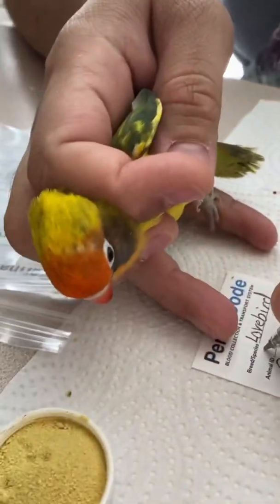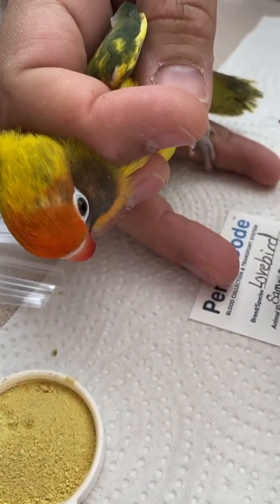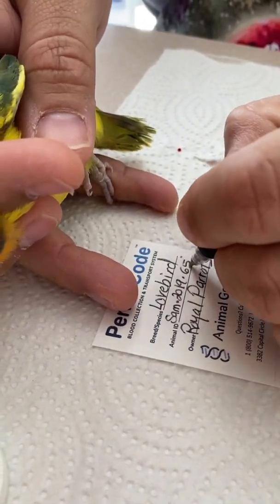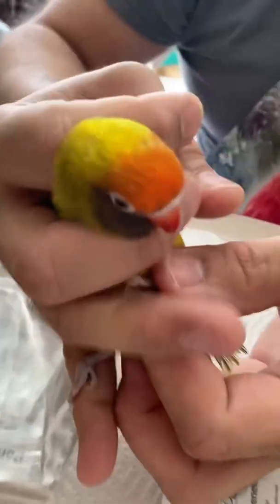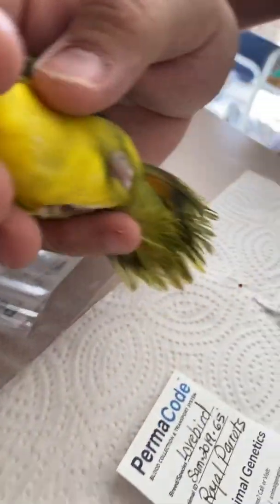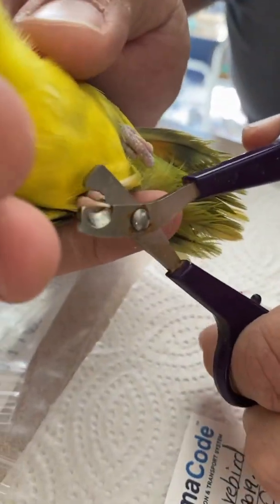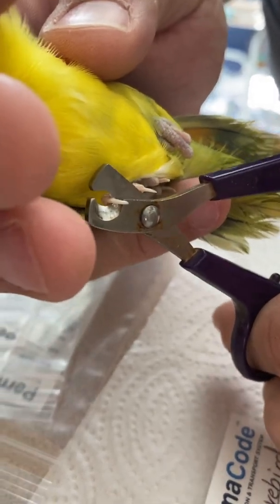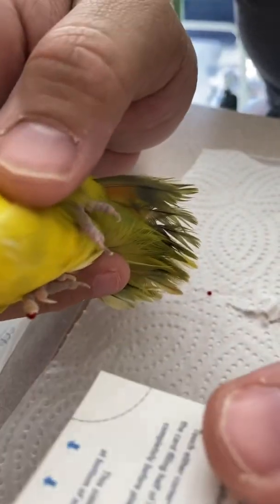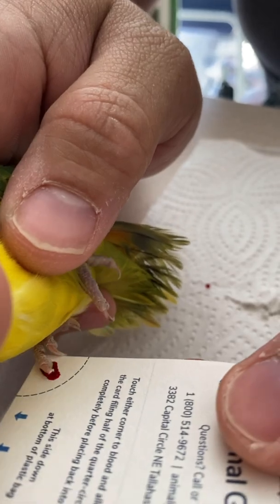I'm going to back it up a minute here because I want you to see how Dennis grabs the bird's nail. On the bird's nail, you will see the quick, which is a vein that contains a blood vessel. That is the part of the nail that you want to trim just a little to get a little bit of blood out to put on the DNA card. If you look closely, you can see the white part of the nail and the pink part of the nail — the pink part is the quick, and that's where the blood is going to come out if you trim that just a little.